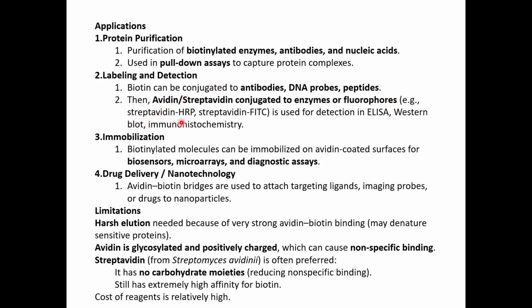Example, streptavidin HRP, streptavidin FITC. So this is used for detection in case of ELISA, Western blot, immunohistochemistry, etc.